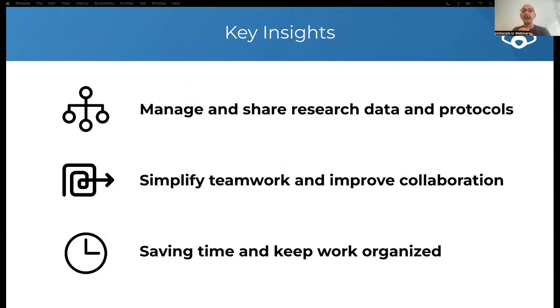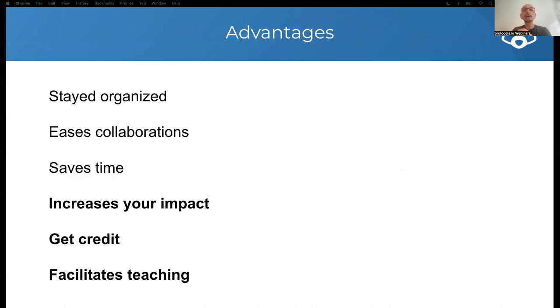And I will describe next how protocols.io can support, facilitate, and increase the quality of your research and teaching because it allows you to manage and share research data and protocols. It allows you to simplify teamwork and improve collaborations, and it allows you to save time and keep your work organized. Protocols.io is also a tool to increase your impact as a researcher, to get granular credit for your technical and methodological discoveries and innovations, and to improve your performance as an educator.